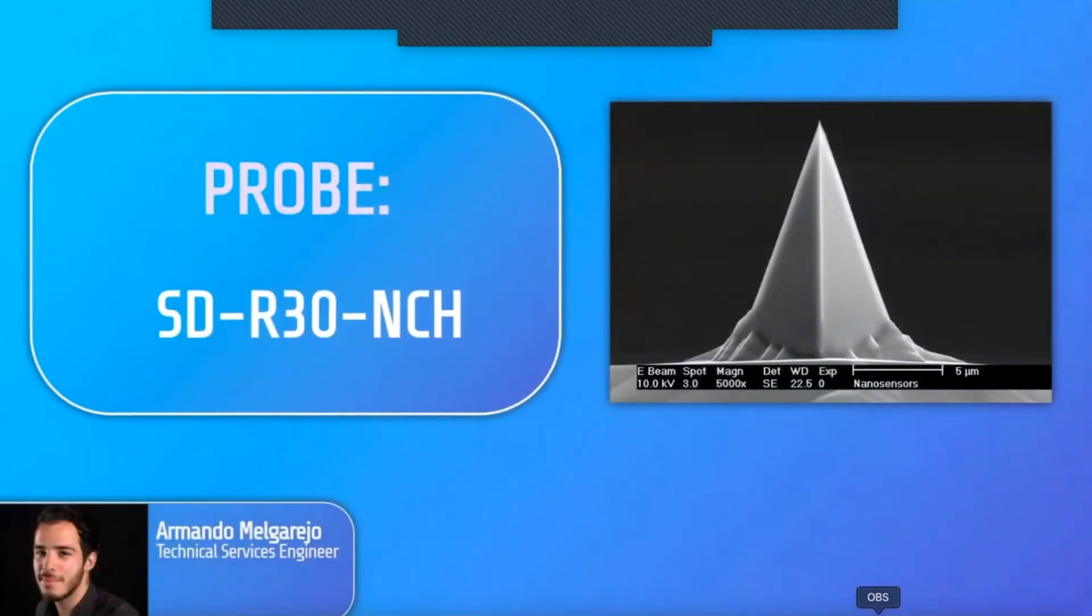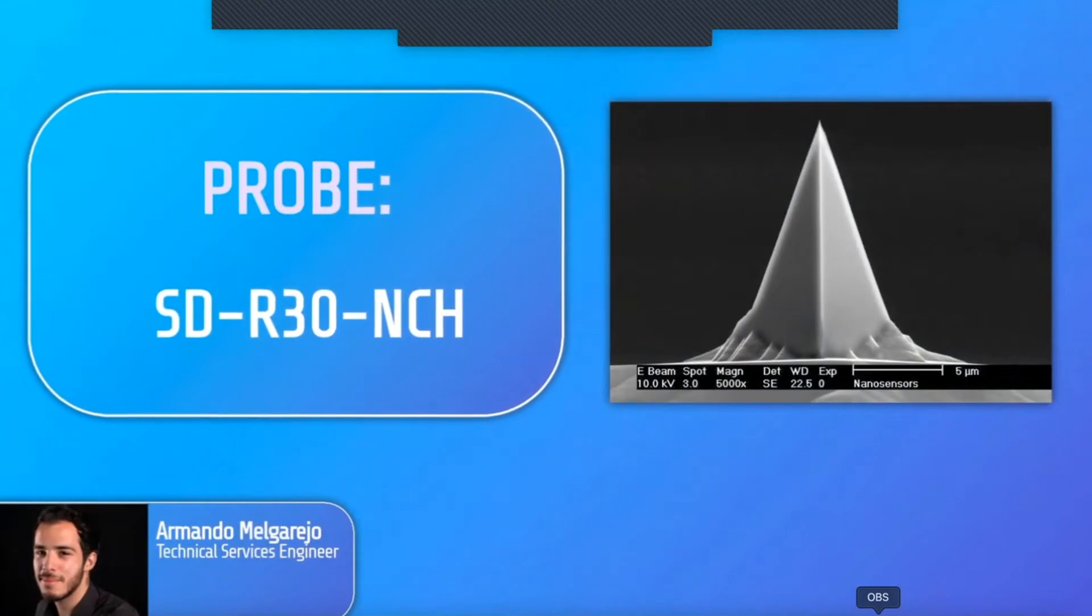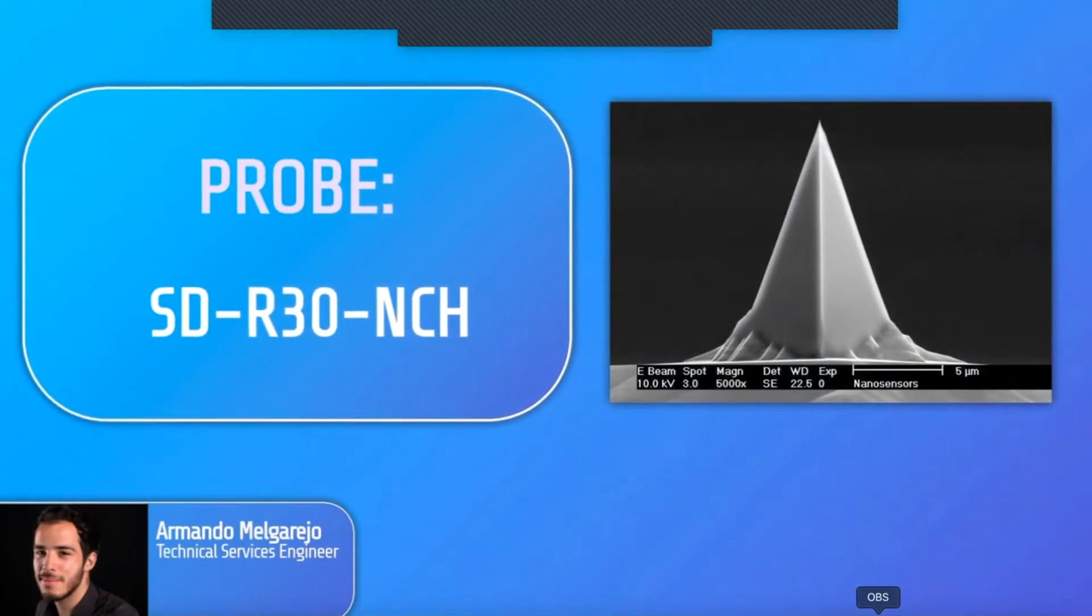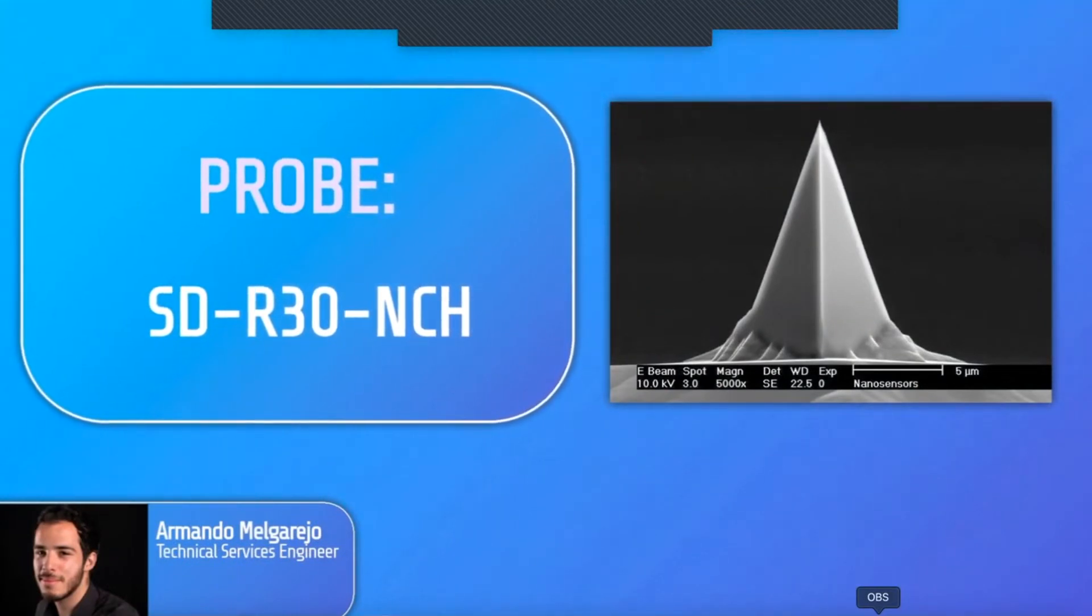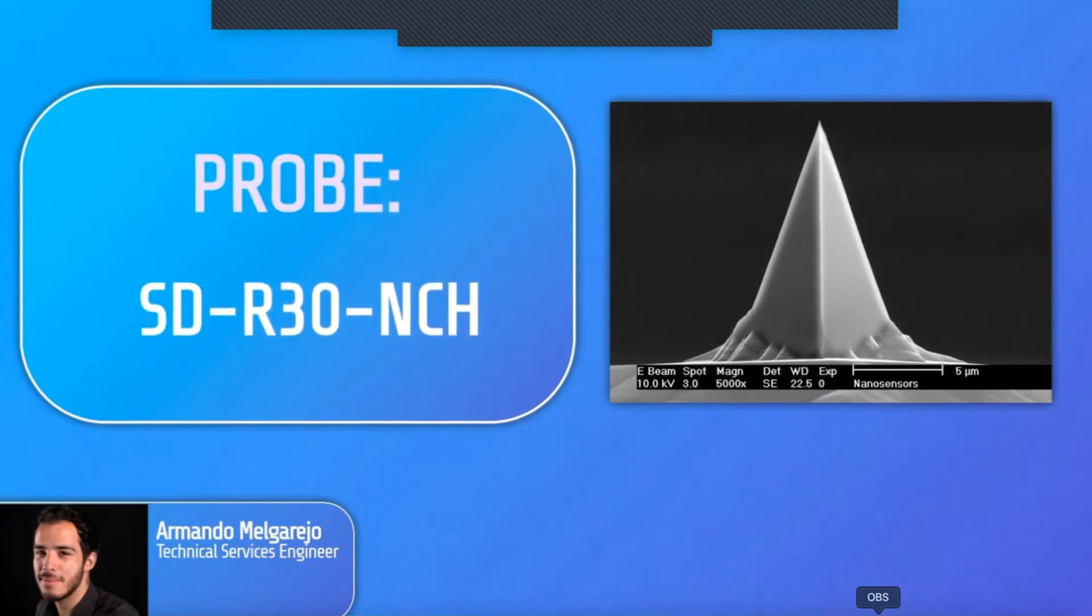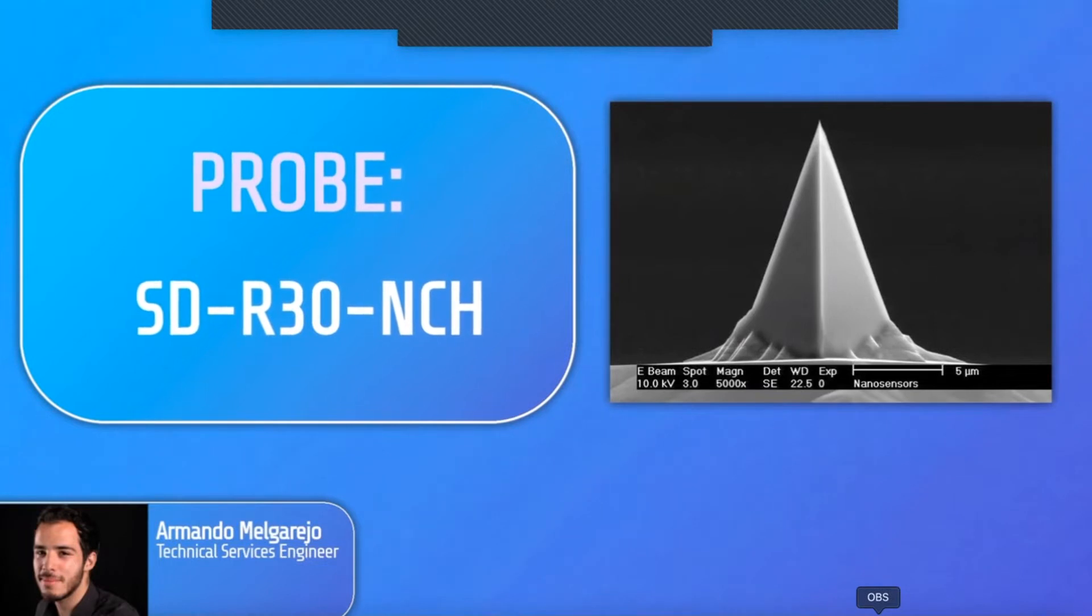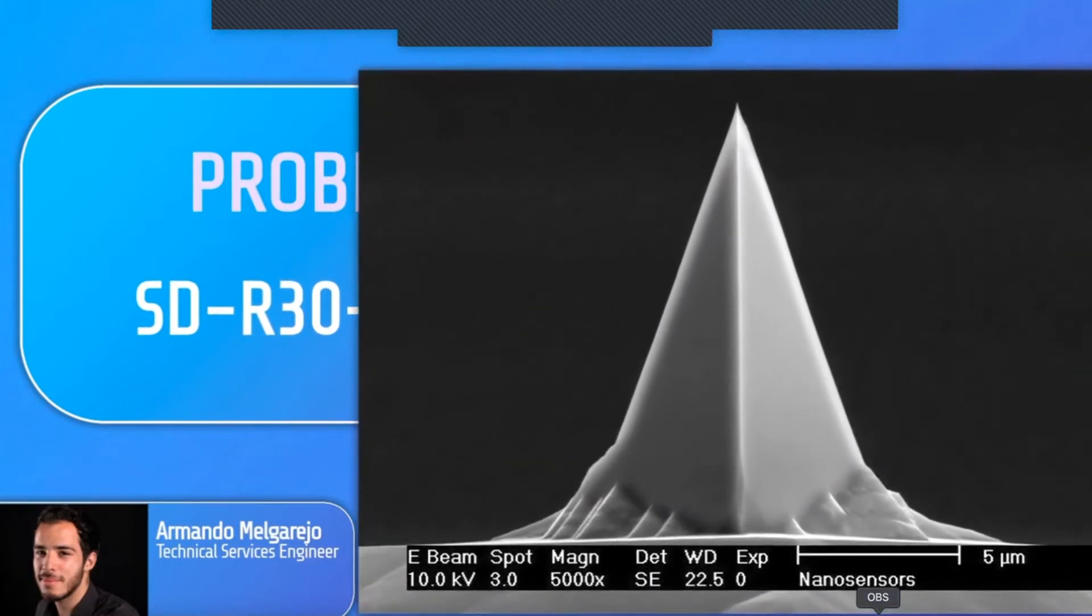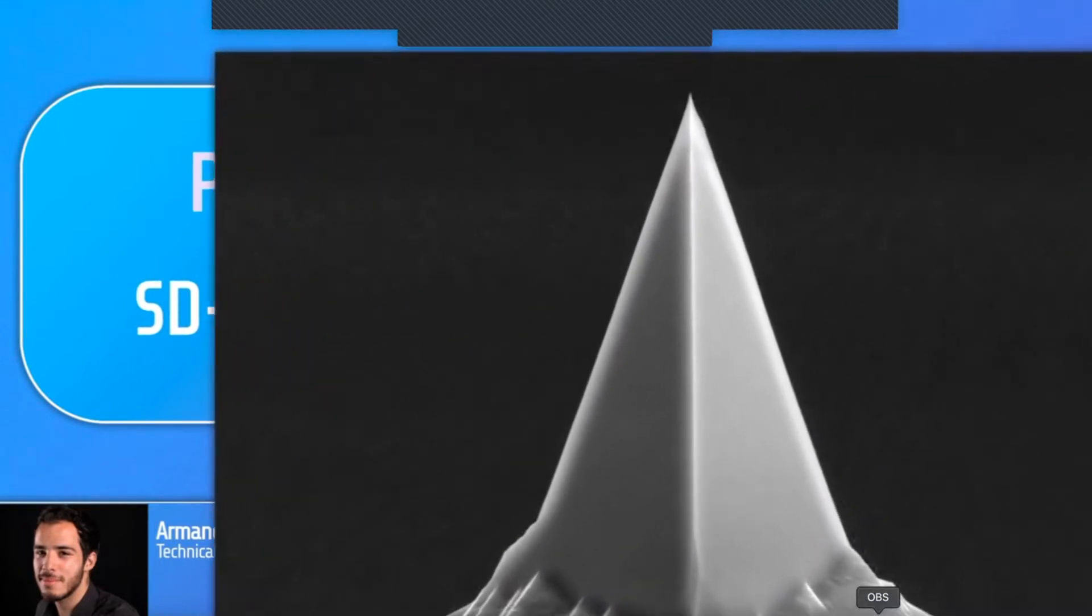For the acquisition, I'll use a relatively stiff probe called SDR30NCH, an AFM cantilever tip with its spring constant of around 30 N per meter, to image the sample. This type of probe is suitable for imaging samples with a modulus range from 1 MPa to 10 GPa.